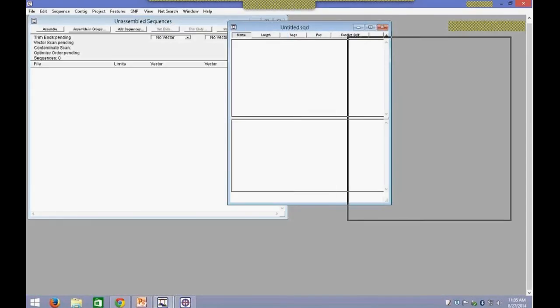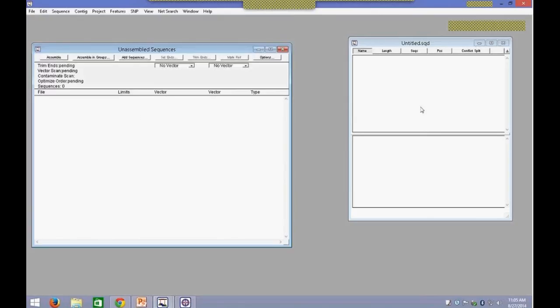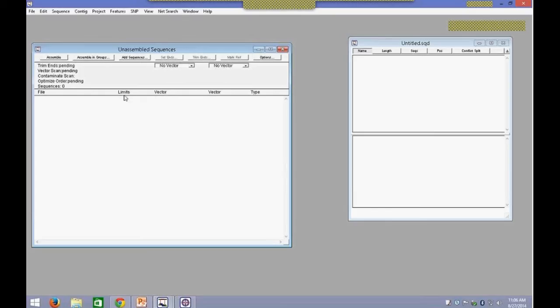When the program first opens, you'll get two main windows. One is the Unassembled Sequences window, and one is the Contig window to your right. Before performing the assembly, you'll focus mainly on the Unassembled Sequences window. This is where you will see your total sequences listed, all the reads that you've input, as well as your reference sequences if you have any. You'll be able to choose the type of assembly you would like to do, specify your reference sequence, add trimming, adjust other options, and add vector sequences.